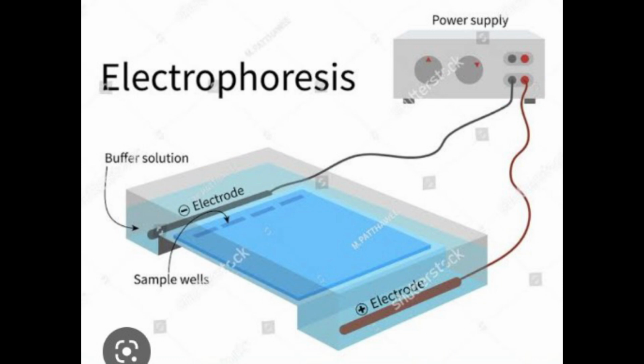Replace the cover of the electrophoretic cell with the positive symbol on the cover connected to the positive on the cell, so that the anode, the positive electrode, is the bottom electrode. Check the electrical connection of the cell to ensure that the solution is not connected with either banana plug, and connect the anode to the positive terminal on the power supply and the cathode to the negative terminal. Apply 15 milliamperes per gel until the protein moves out of the wells into the stacking gel. Then 35 milliamperes per gel until the tracking dye reaches the bottom of the gel, about 45 minutes in this system.